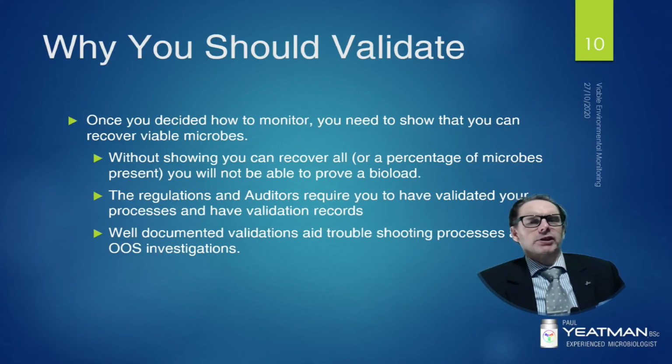So if your validation shows you recovered 50% of colony forming units from a particular surface using a particular recovery method, then you've got something to talk about in your discussion when you do your investigation into your alert or action.